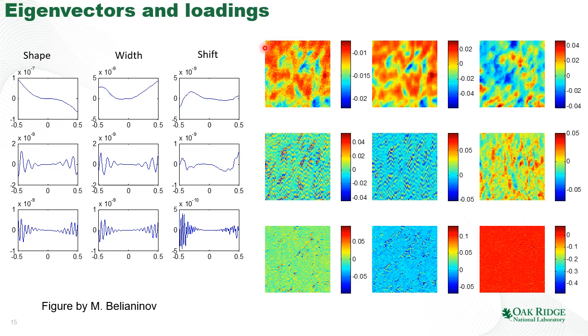And in many cases, it gives us some insight about what is the relevant physics in the system, but it's only insight, it's not a proof. So we really need to analyze data in different ways, which we can do now because now we know what to look for.